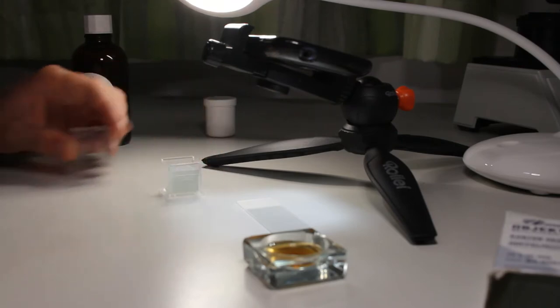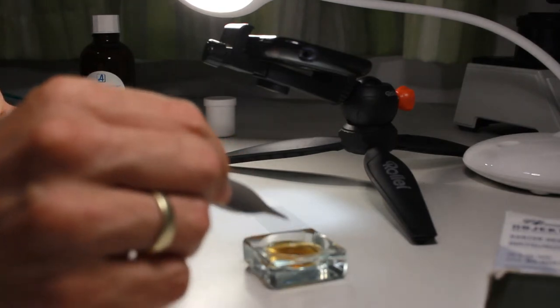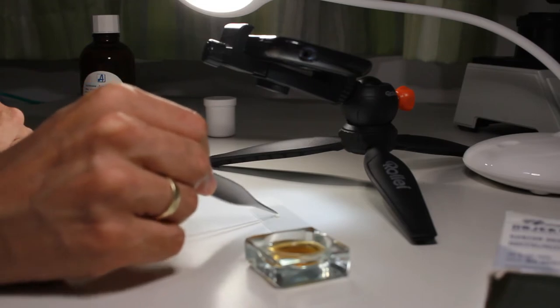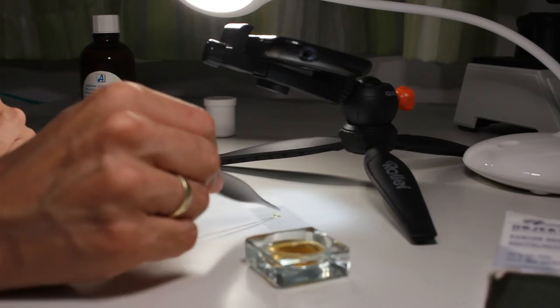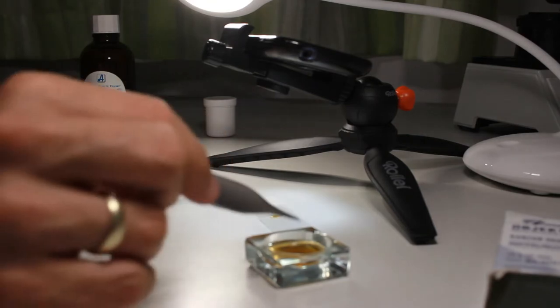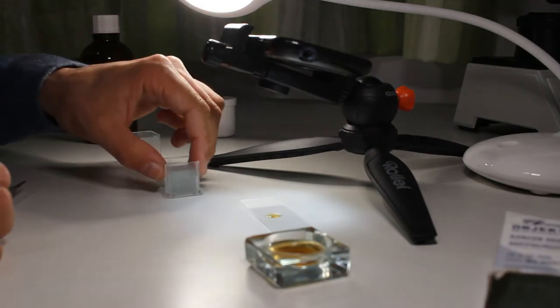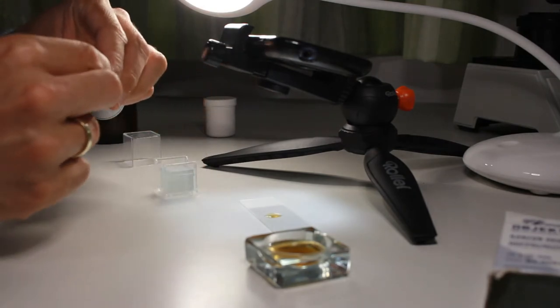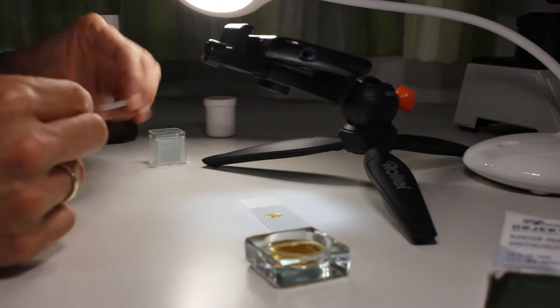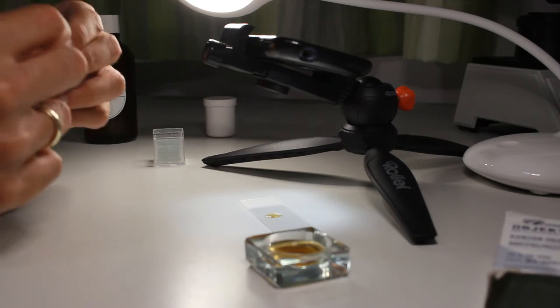simply preparing the slide. I do not narrate while I am doing that, and the reason is that I do a voiceover later on, okay? I want to concentrate on making the slide first, and then all of the narration will be done separately. I use a small MP3 recorder for doing the narration, and then I use the editing program for combining the sound with the image.